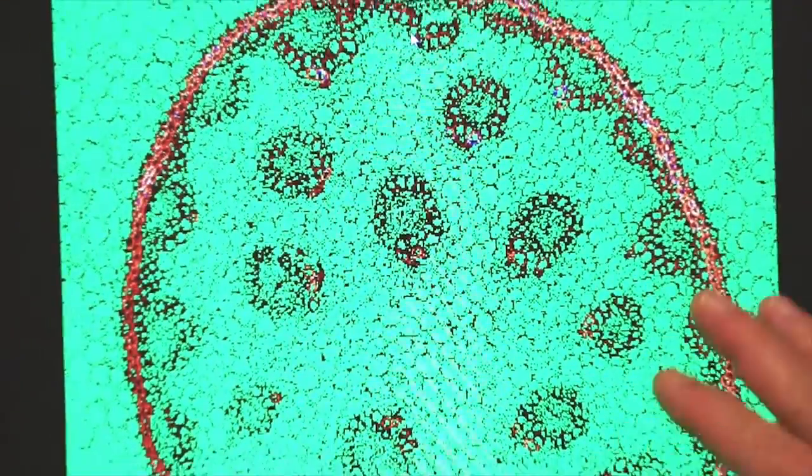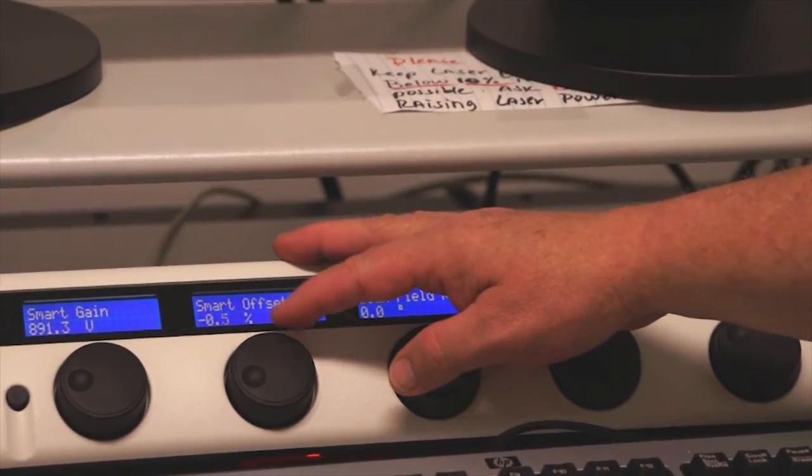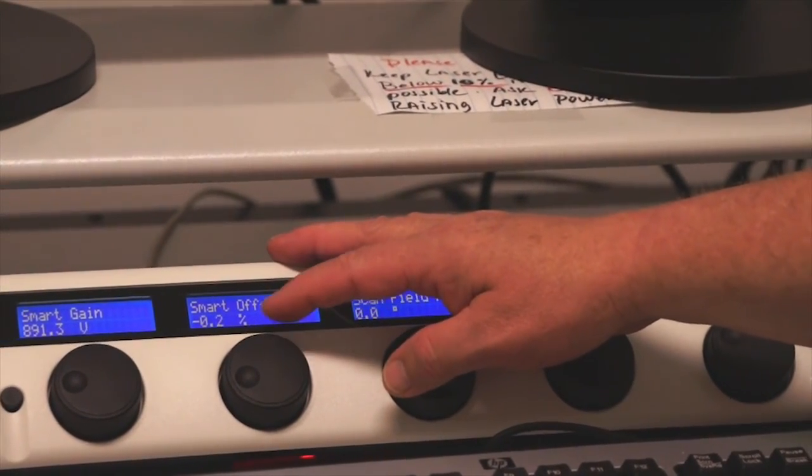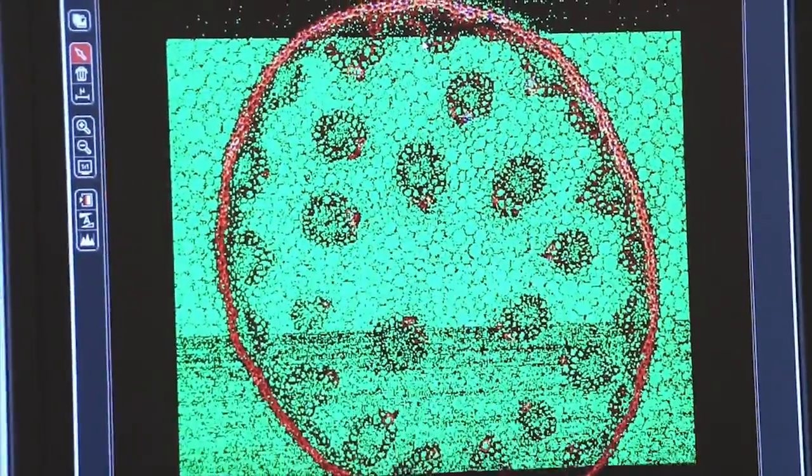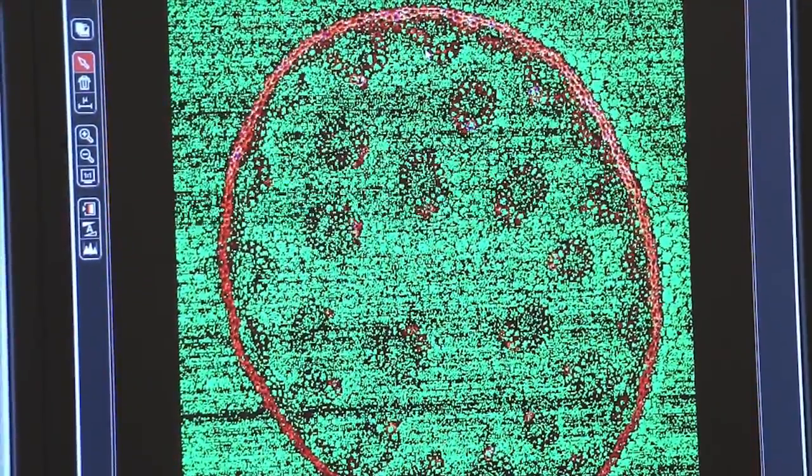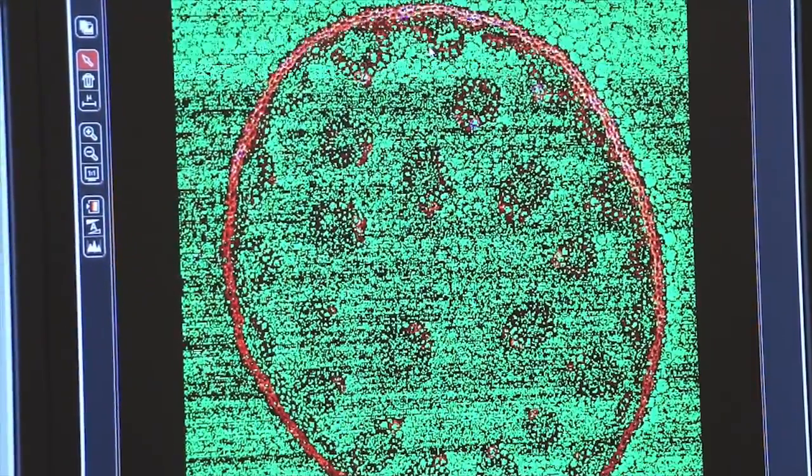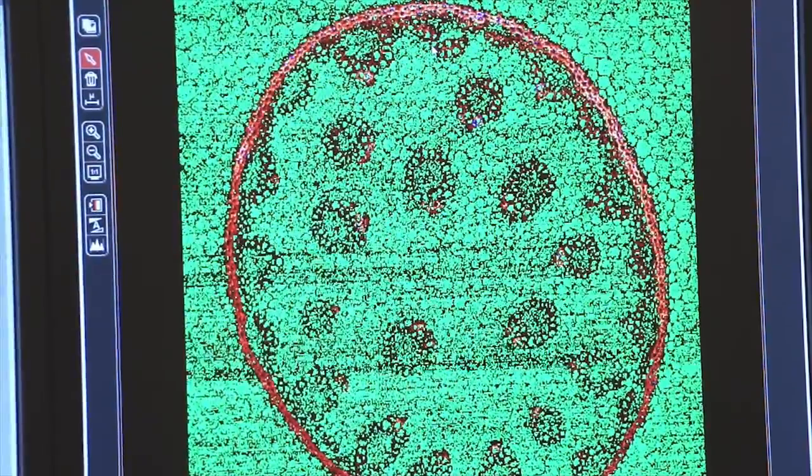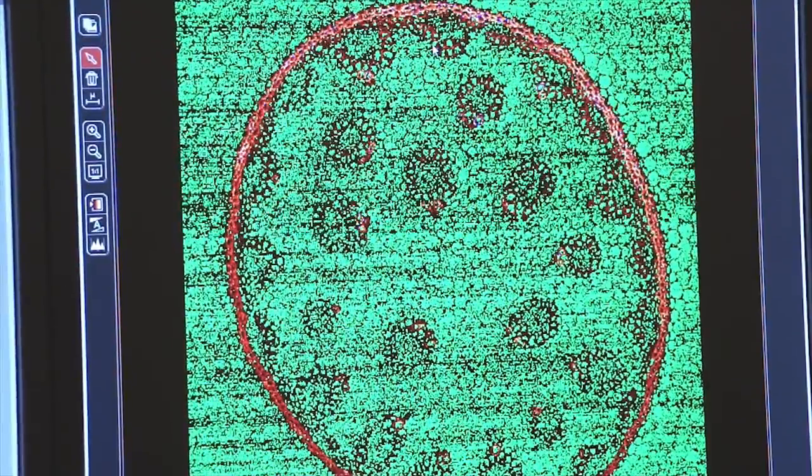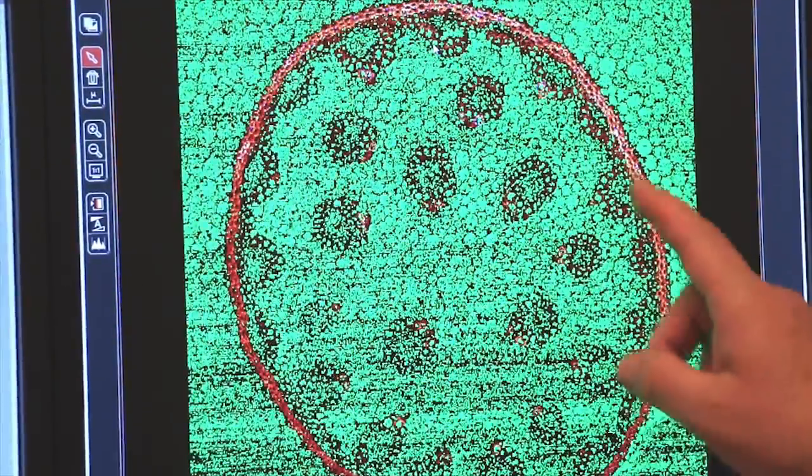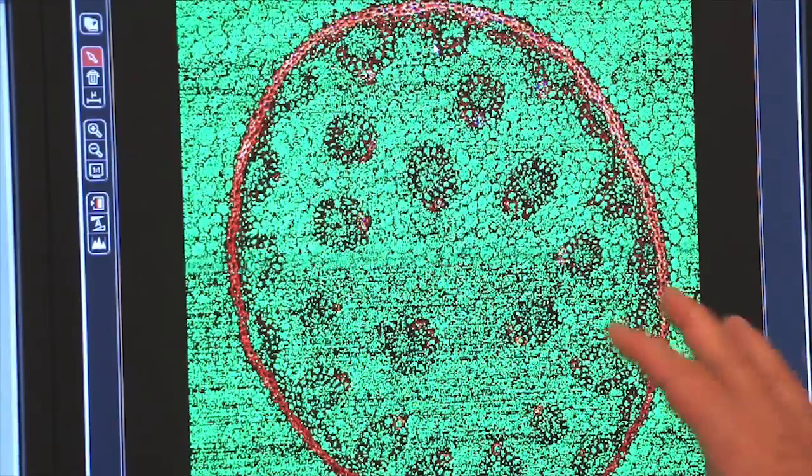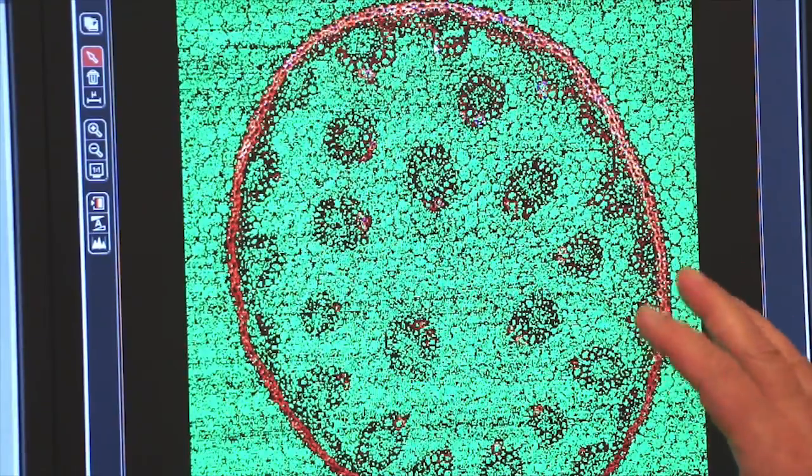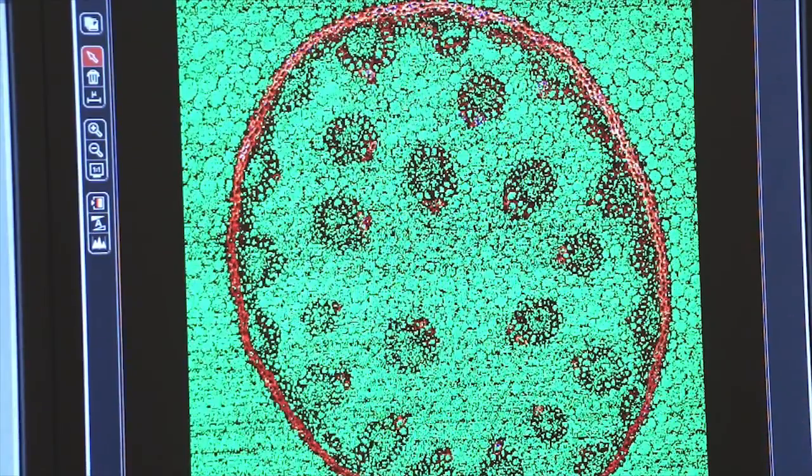For offset, I want to have as few green pixels as possible just before it goes completely dark. So I adjust my offset until I have just a few green pixels and you can see there that's the proper setting for my offset. And so by using the lookup table and the blue and green pixels, I can quickly decide where my smart gain and my offset should be.